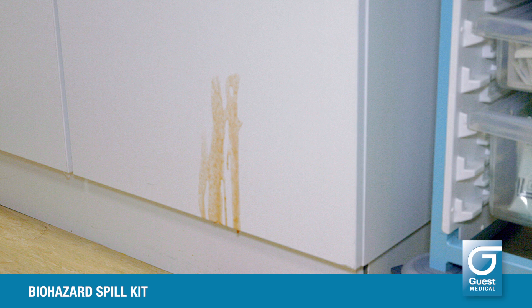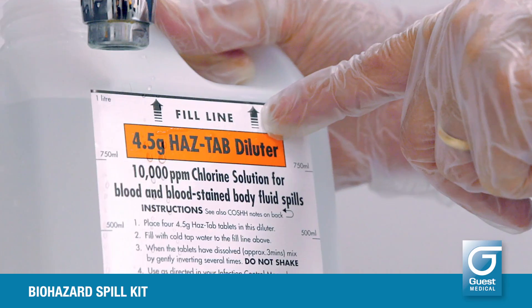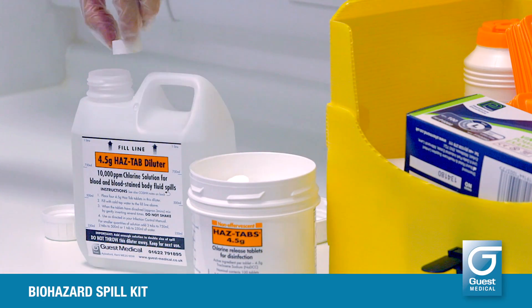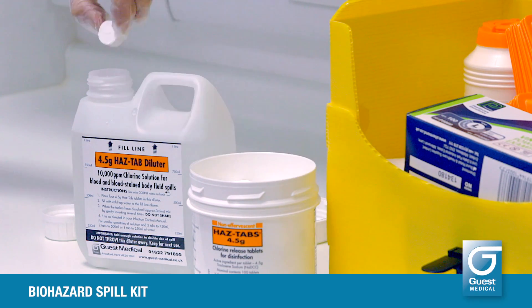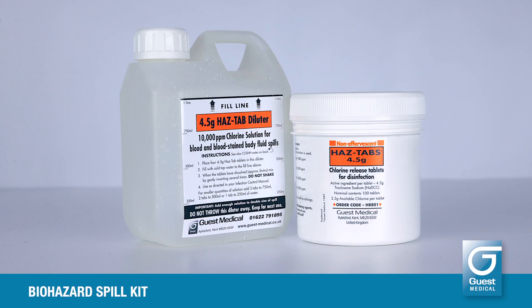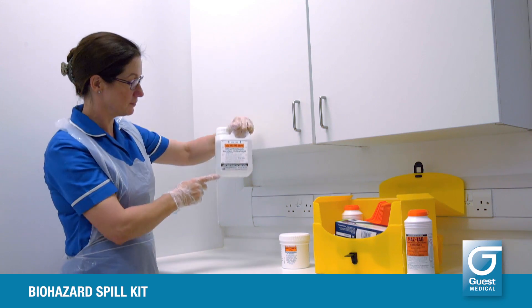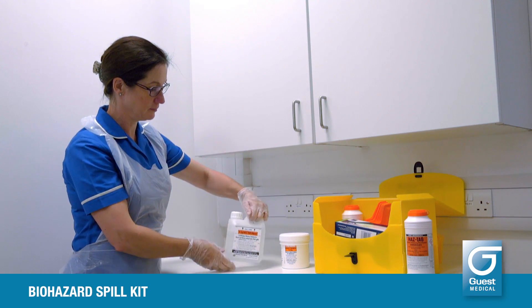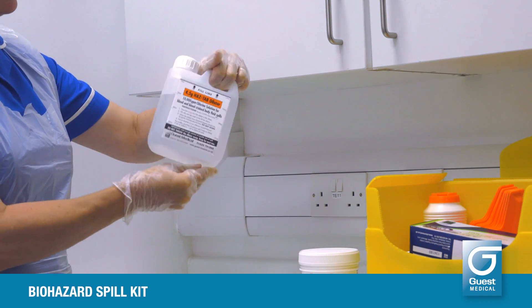For splashes, drips or smears where the granules cannot be used, make up a 10,000 parts per million available chlorine solution by adding four of the 4.5 gram HAZTAPs to one litre of cold water in the diluter bottle. Leave for three to four minutes to dissolve. The tablets do not effervesce — they just gently break down into a sludge on the bottom of the diluter. When they have completely dissolved, screw the cap down tightly and invert the diluter gently to mix the solution. Do not shake the diluter to mix.